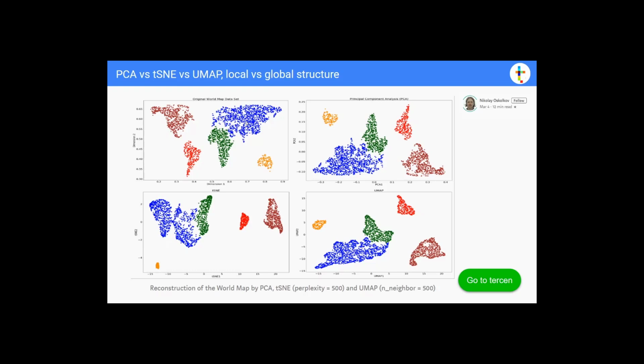And he shows what happens when you use these dimension reductions. Even though he's doing a reduction back to 2 dimensions, it's to show the transformation that happens to your data. PCA scores well here because it's cheating, because the world map is a linear longitude and latitude problem, so PCA works very well.